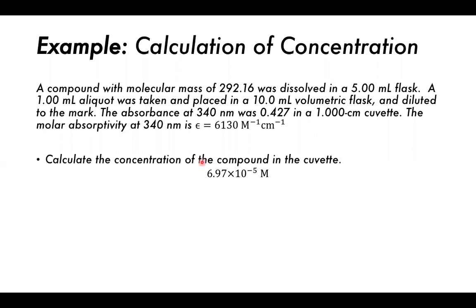We can find the concentration in the cuvette because we have the absorbance and the path length of 1 centimeter, and the molar absorptivity.